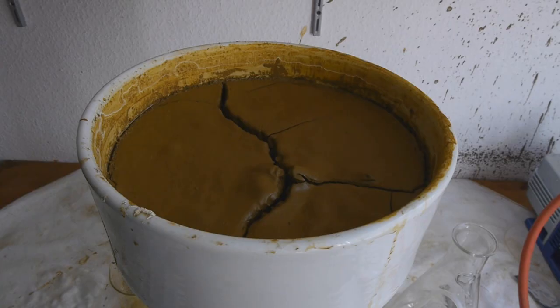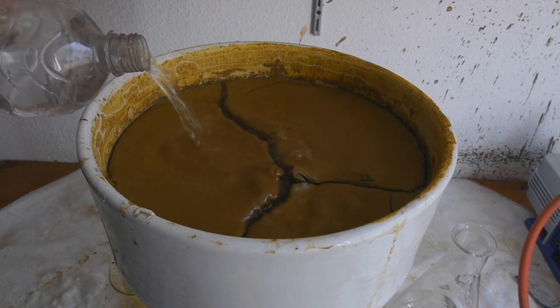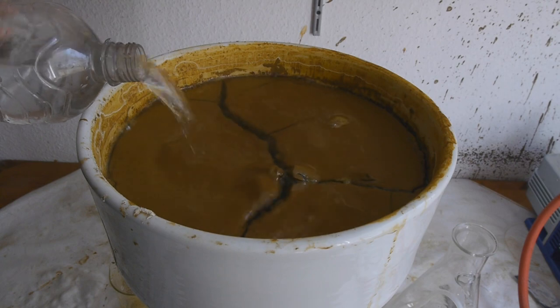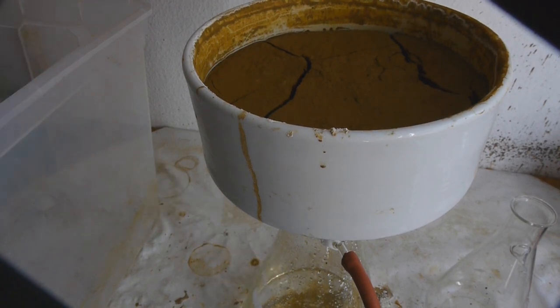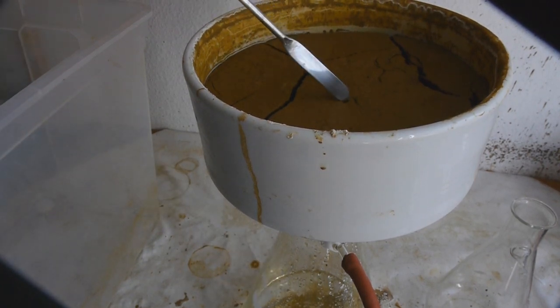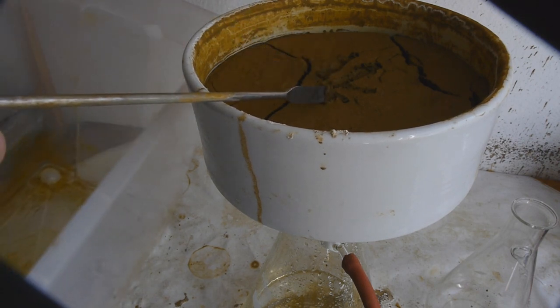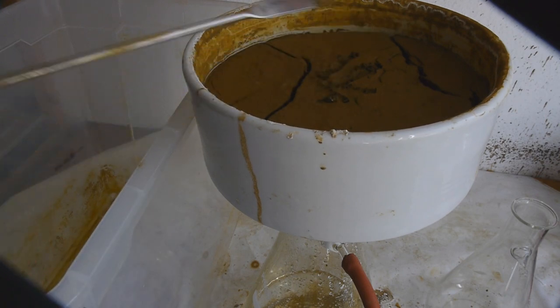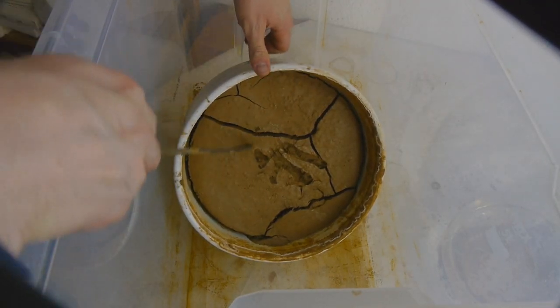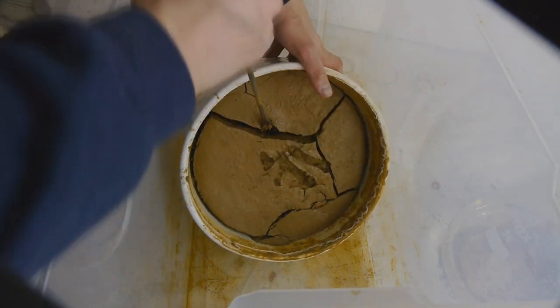Now for the last washing step, one last time, 1.5 liters of warm tap water, and then this should be relatively clean. I've let the pump run now until there was no more water dripping out down below, but this is still very wet, so we still need to dry this. And for that we'll put it back into the box that we initially used. I've cleaned out this box just a little bit, not too much because it's going to get dirty again anyway.